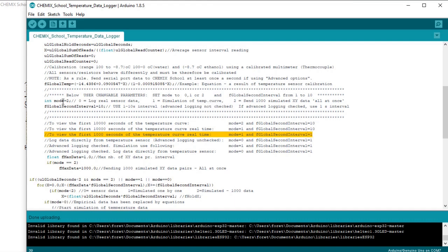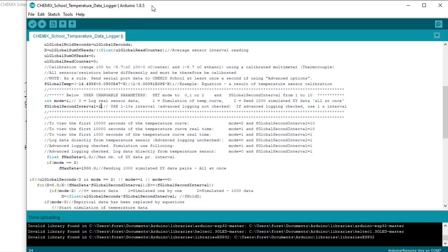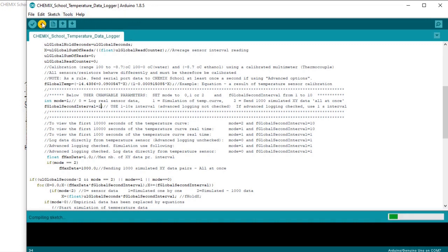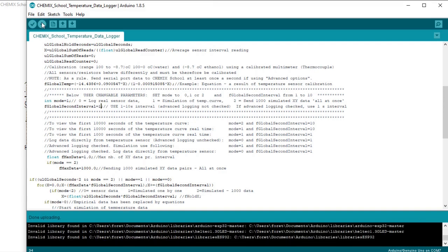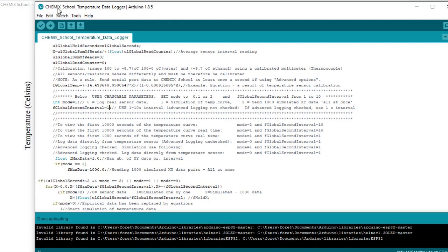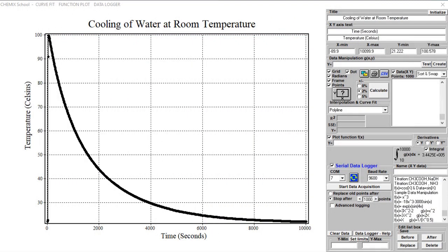To view how the simulation of the temperature experiment looks in real time, set the mode parameter to 1 and the interval parameter to 1. Upload the sketch to the microcontroller. To start logging, click the Data Acquisition button.